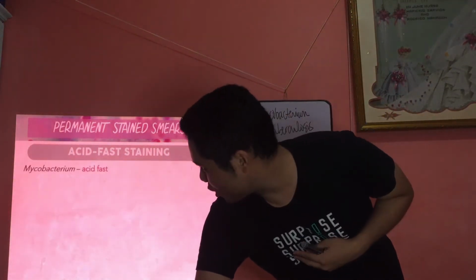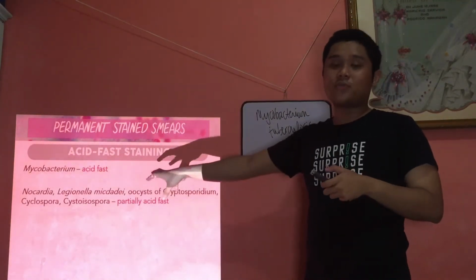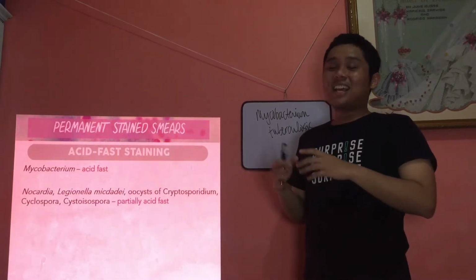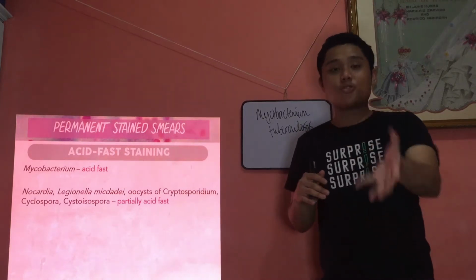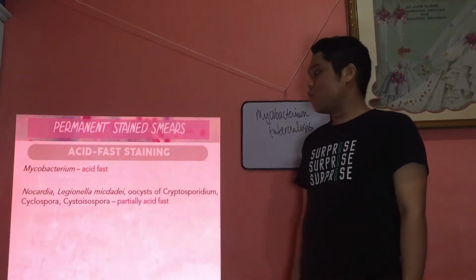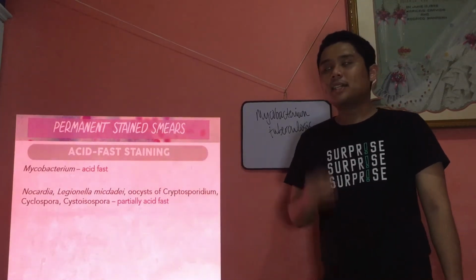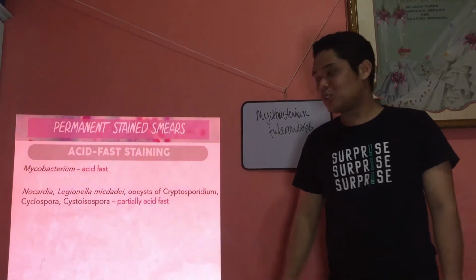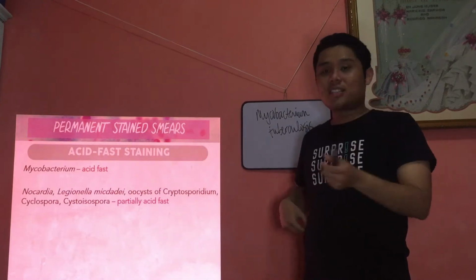This is an example: Mycobacterium is the true acid fast. It has a large content of long chain fatty acids in its cell wall. That's why it is considered a true acid fast. And we have what we call the partially acid fast: Nocardia, Legionella and related bacteria. And you have oocysts of Cryptosporidium, Cyclospora, and Cystoisospora. Familiar? These are your coccidians.